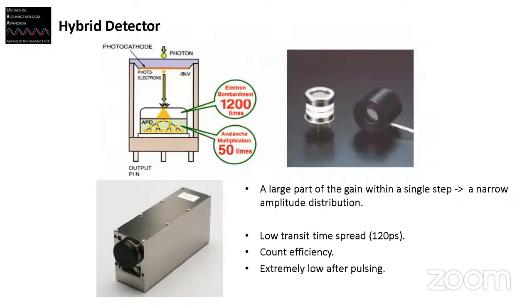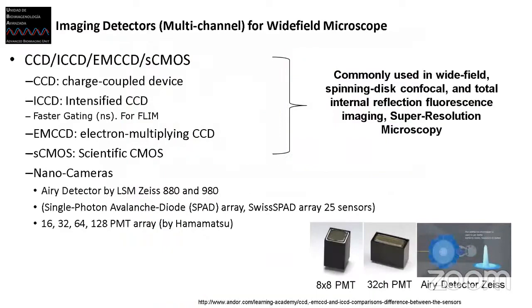Nowadays, there are hybrid detectors, which combine amplification and APDs, and these are very nice. We use them for lifetime in the LFD with Enrico for many applications. They are very useful and extremely sensitive, and the bad thing is they are quite expensive, probably 2 or 3 times the cost of a PMT or 2 or 3 times an APD. So they are quite expensive still nowadays.